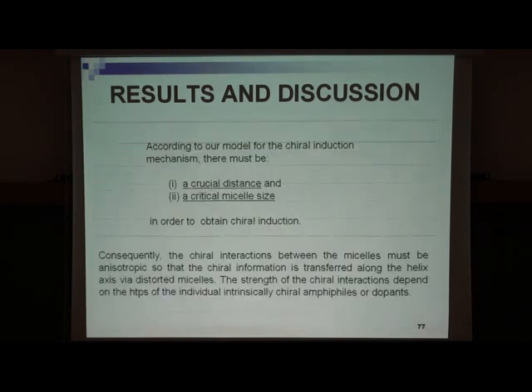According to the results and Berard's results, we can conclude that in order to transfer chirality to the phases, there must be a critical distance and a critical micelle size. I think this may be the first evidence of Berard's suggestion, because I don't see anything about these results in the literature.